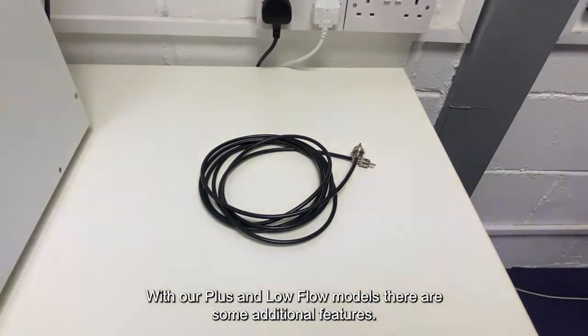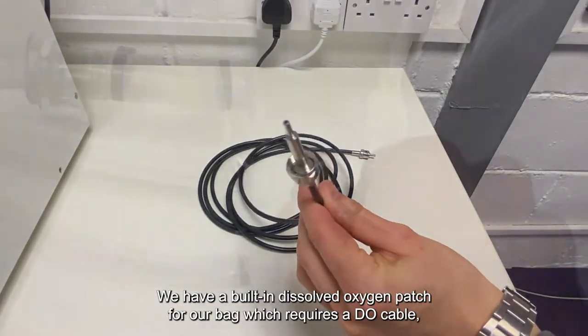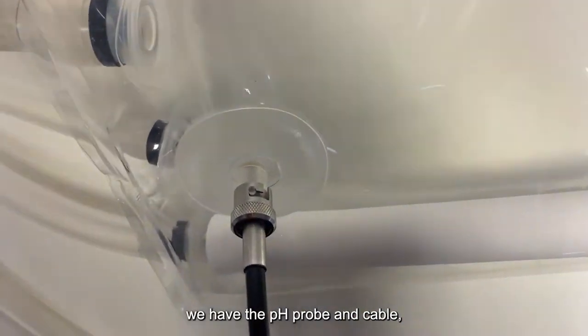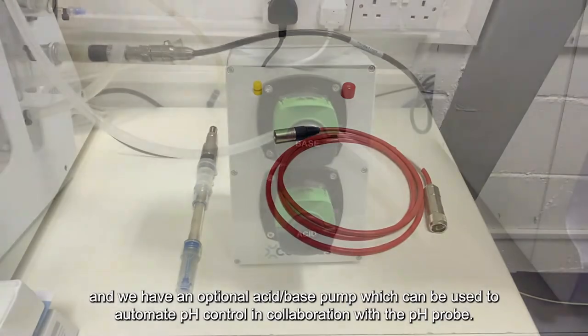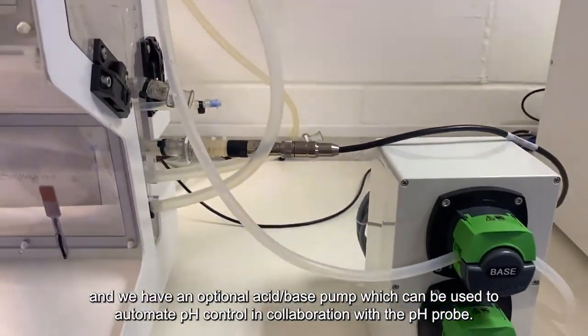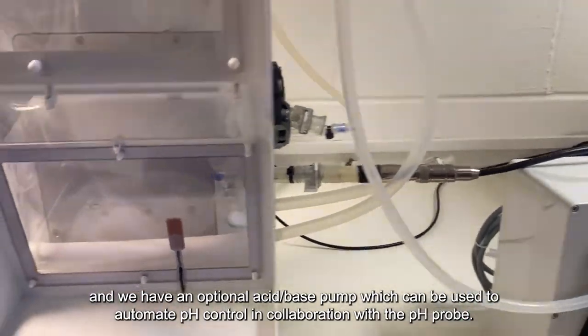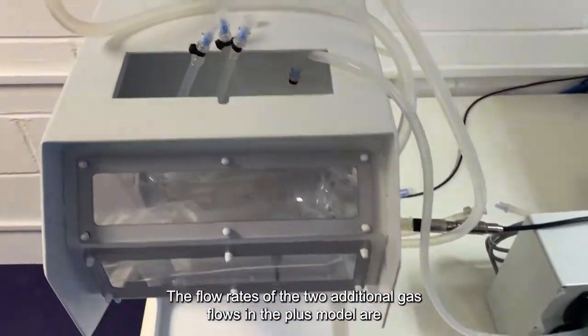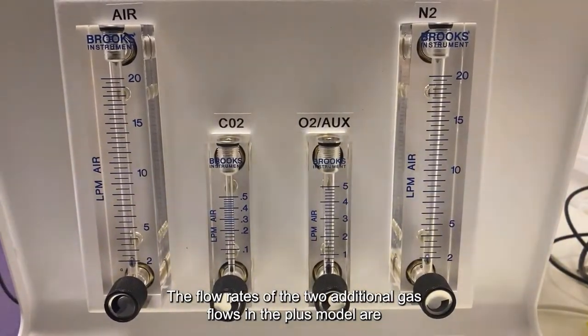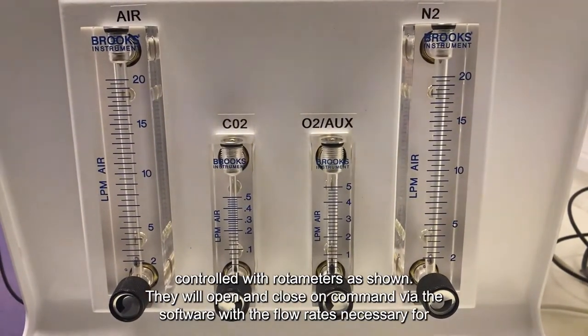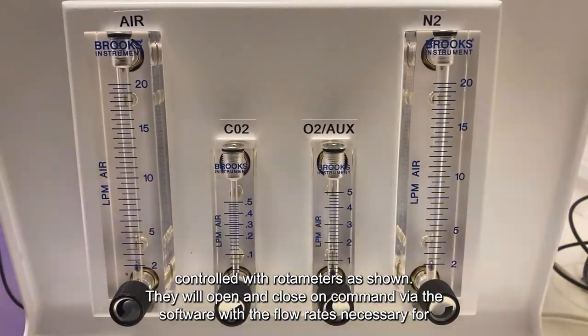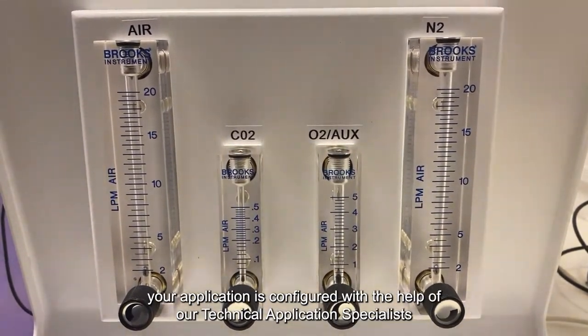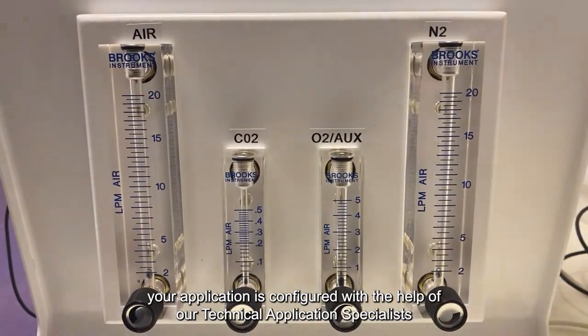With our plus and low flow models, there are some additional features. We have a built-in dissolved oxygen patch for our bag, which requires a DO cable. We have the pH probing cable. And we have the optional acid-base pump, which can be used to automate pH control in collaboration with the pH probe. The pH can also be automated with the controller through the controlled injection of CO2. The flow rates of the two additional gas flows in the plus model are controlled with the rotometers as shown. They will open and close in command via the software, and the flow rates necessary for your application is configured with the help of our technical application specialists prior to running.